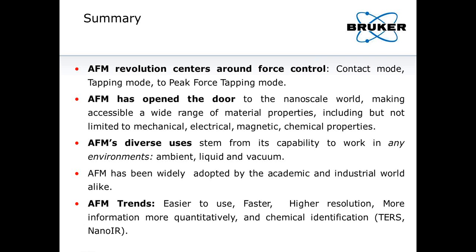That's a challenge. Related to that, when you do STM in liquid you see a lot of beautiful atomic resolution structures. Because in liquid, let's say you have a single crystal gold or platinum, and if you cover that with very pure water, it can be as clean as under UHV conditions. So that's why it's easier to do high resolution in fluid versus in air. But still, you can do it.